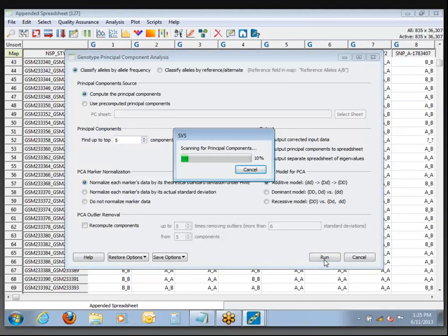Principal components is one of the functions in the software that is multi-threaded. So if you have a dual-core, quad-core, or eight-core CPU, you'll see a big performance boost on this one.